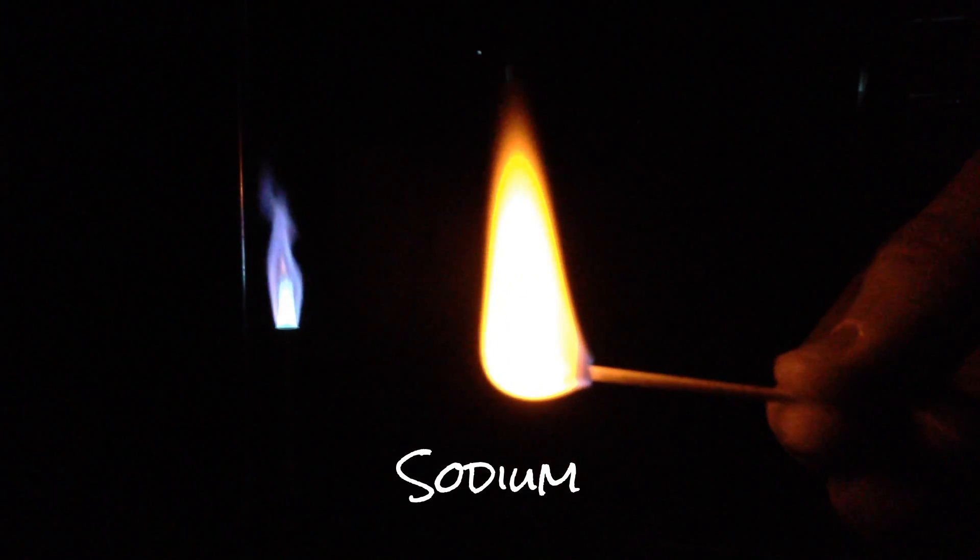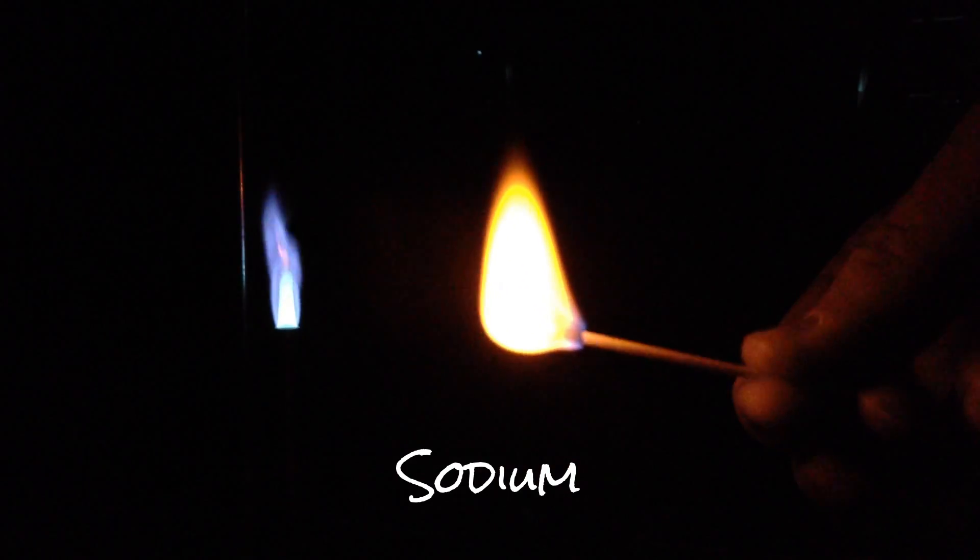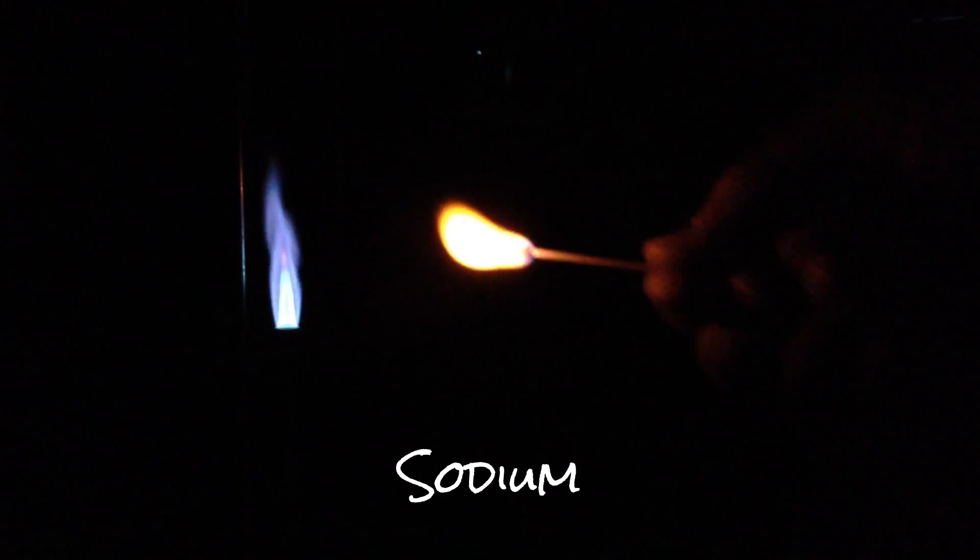Next up is my sodium. I'm going to take some sodium plus-one ions from sodium chloride, dip the cotton swab in some methanol, get some sodium chloride on my cotton swab, and light it up. And wow, look at that nice yellowy color. That's indicative of the sodium lamps that you see in parking lots — it's the classic color of sodium electrons leaping back toward the nucleus.